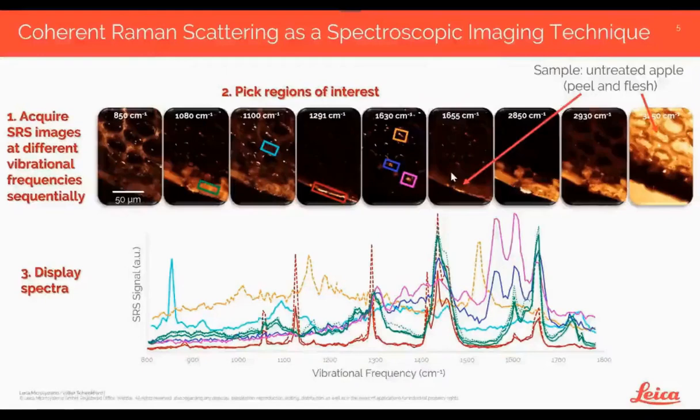Thank you, Dr. Spicard. Our next question: what is the highest spectral resolution that can be achieved? Could a frequency difference of 5 centimeters to the minus 1 be resolved?